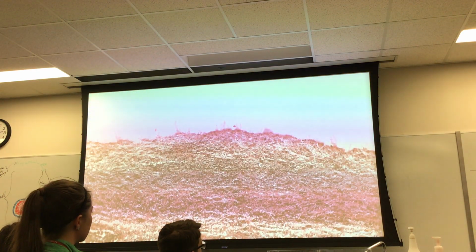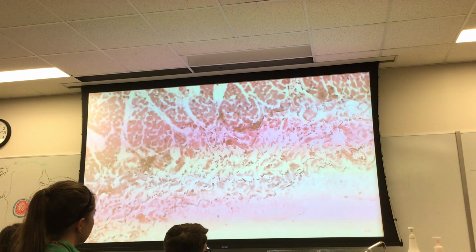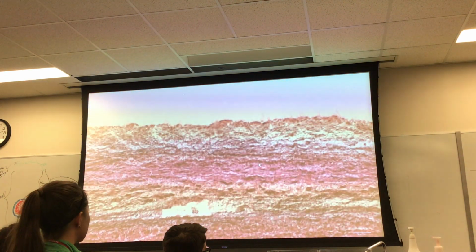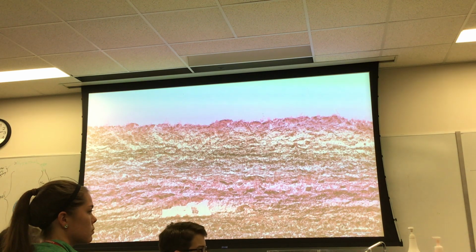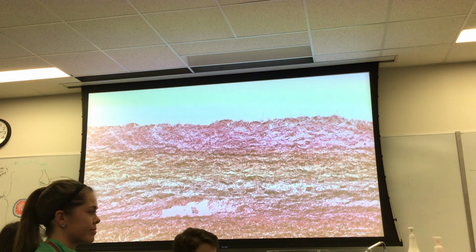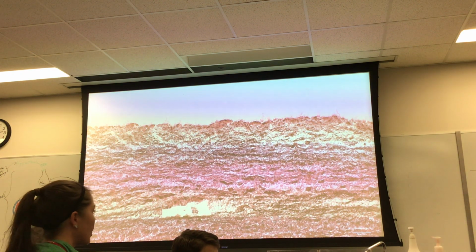I've got this surface to look at, and I've got this surface down here to look at. As we move along, one of the things we're going to appreciate is that there are reasons why this one is called the epicardium, and there are reasons why this one is called the endocardium. But again, we're going to be talking about elastic fibers, which are stained black here. So my point is, with this tissue stuff that you know, not only are you going to ace this quiz on Friday, but you're going to remember this, because when I see you again in March, we're going to start using this tissue stuff to understand how organs are composed.